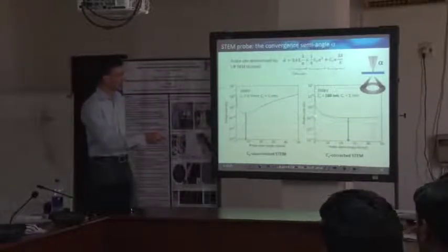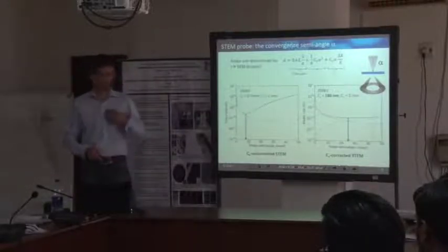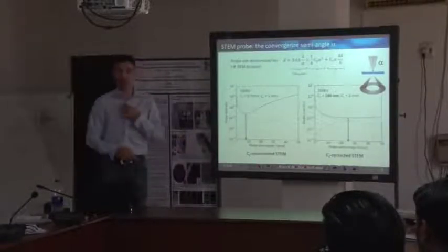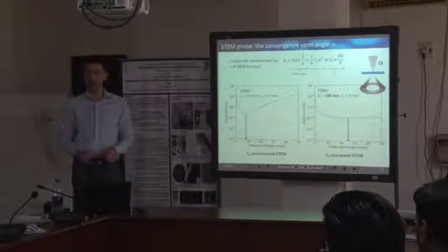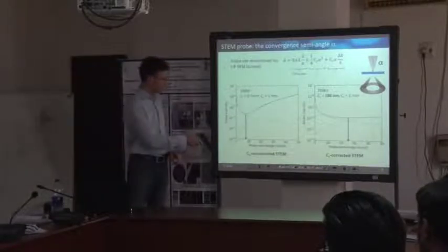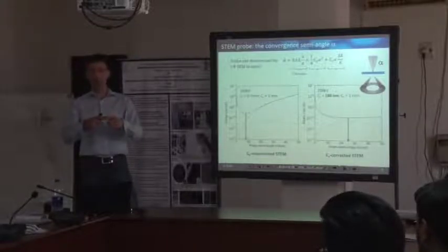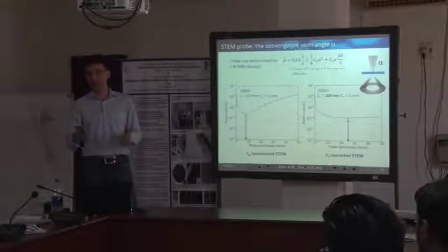And here you can see that the probe is even smaller, so we get down to, let's say, 50 picometers or so, which is smaller by a factor of 5 or 6, by allowing for a larger semi-angle of our probe. So here we have 10 milliradian, here we have 25, a factor of 2.5, but a factor of 2.5 gives us a higher current by a factor of, let's say, 8 to 10. Because just assuming that the current is constant and we just cut with the aperture, it's the area of the aperture which is larger, let's say, by a factor of 7 to 10.